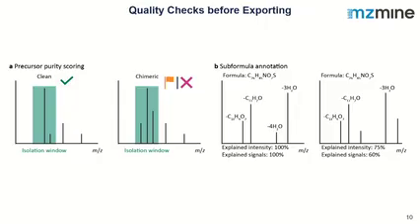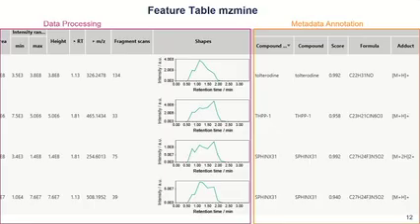So this is also checked before, and then you can say if you only want to export spectra with a high explained intensity or number of signals. And of course, you can also export everything at first, and then it's still stored in your library file itself. So you all the time see those parameters in your table or in your file, and you can remove them later on, but you still keep everything for the first run.